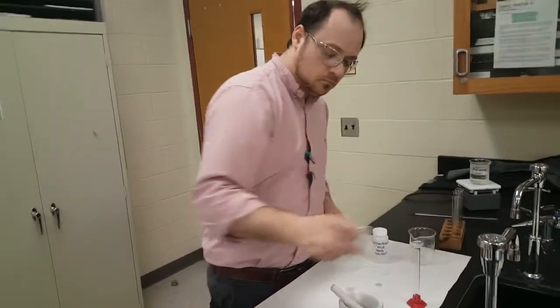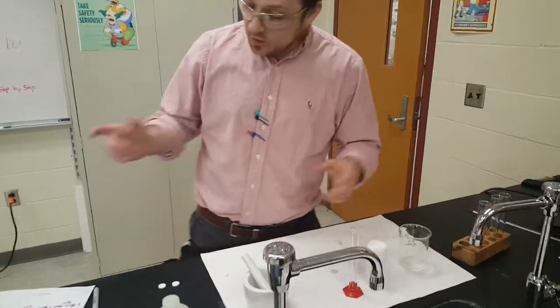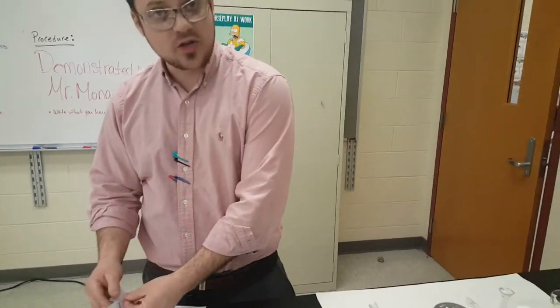So now we're good with concentration. Concentration's out of the way, so you can move that beaker out of the way. Then we've got to do particle size. Okay. That sounds like surface area. Yeah, surface area is particle size.